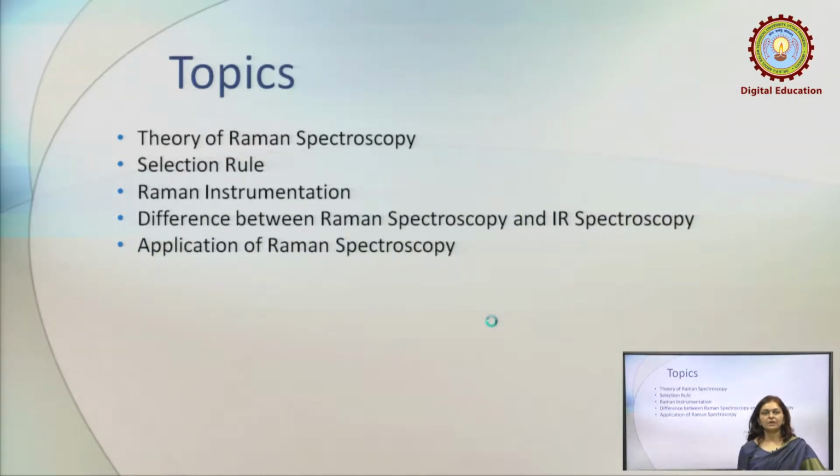The topics we are going to discuss here are the theory of Raman spectroscopy, selection rule, Raman instrumentation, the differences between Raman spectroscopy and IR spectroscopy, and lastly the applications of Raman spectroscopy.